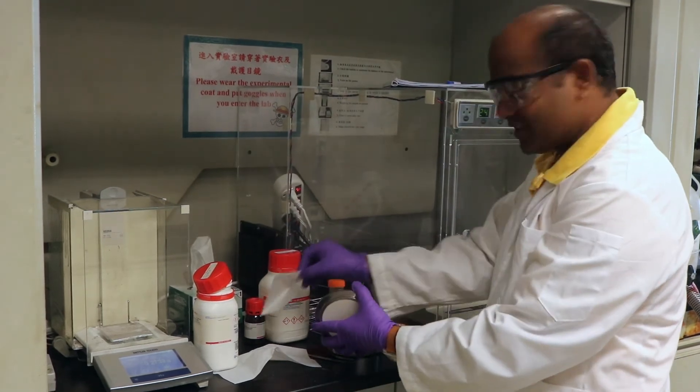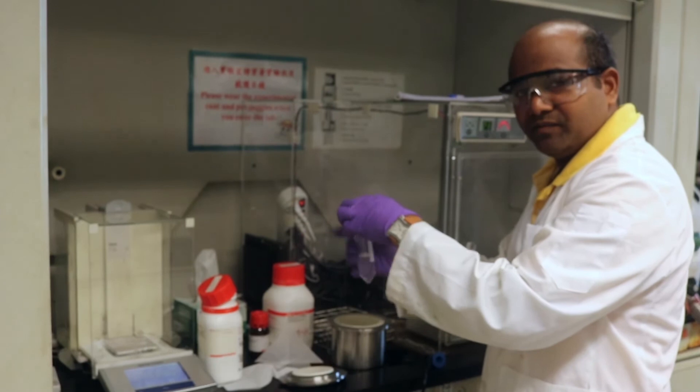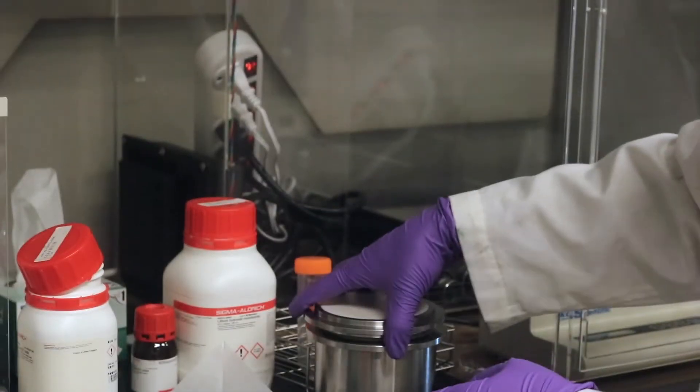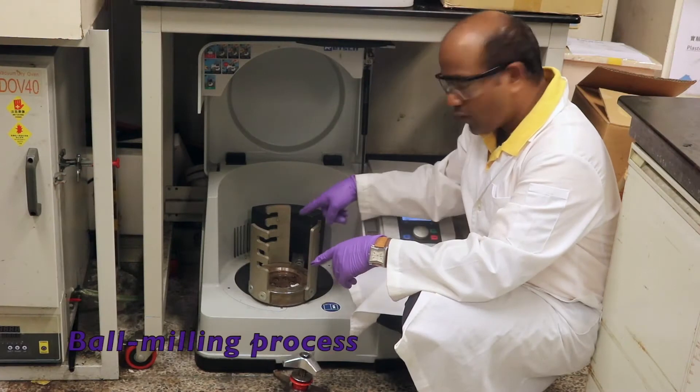These chemicals we are dissolving in isopropanol. These chemicals are then ball milled for 12 hours. This is the ball milling machine.